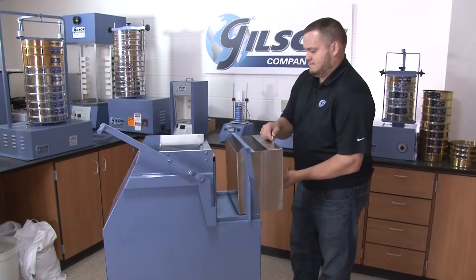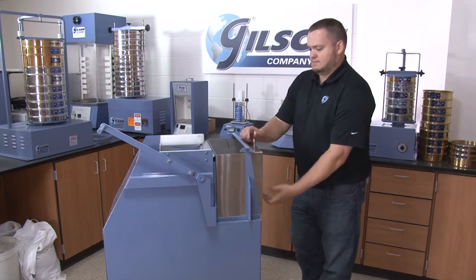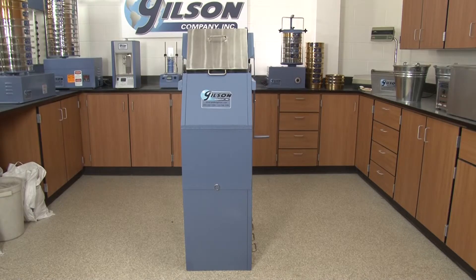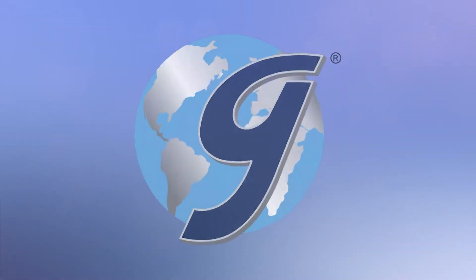The SP6 includes four sample pans and one feed pan, but additional pans are available to make this rugged and efficient unit the right choice for your material testing lab.